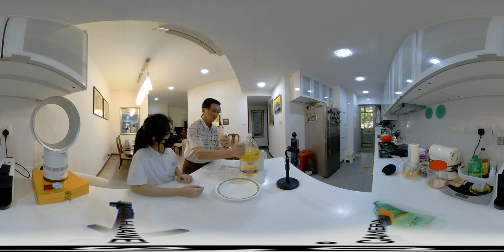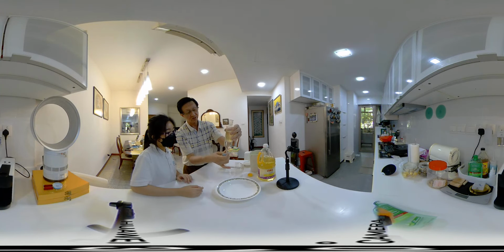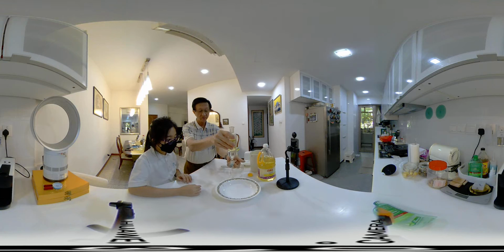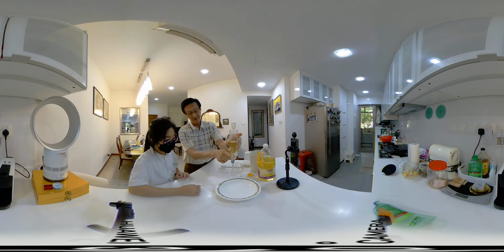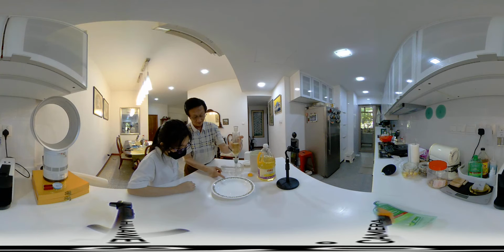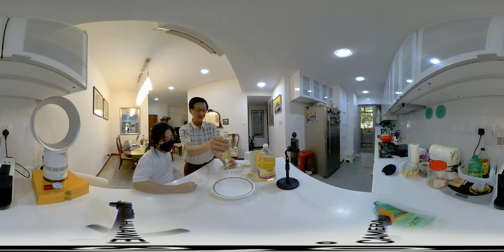Okay? So what we'll do is, we don't want to shake it. You shake it, there's too much bubble. We remove the stopper from there, and now we drain off the water by turning the tap, and therefore it drains off. Okay? And just before all the water drains off, we turn off that. Then we remove this. Hopefully there's all water, but there's still a little bit of oil, right? Yeah. And then after we take another container, we drain off until the oil.